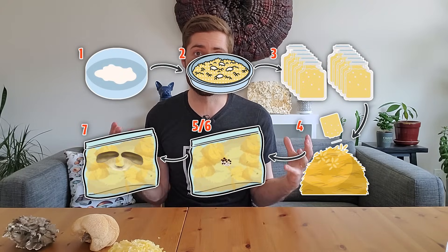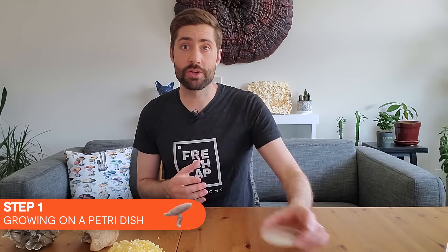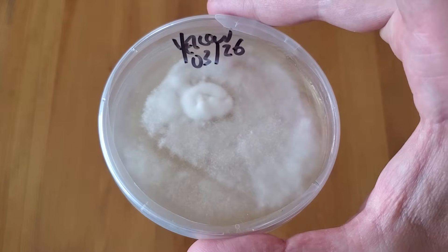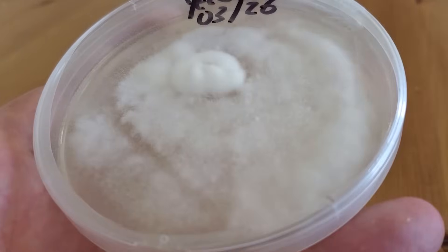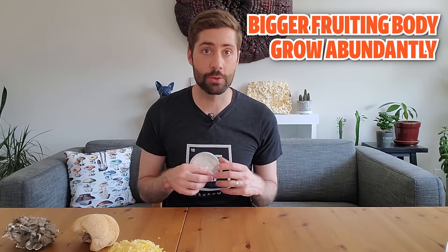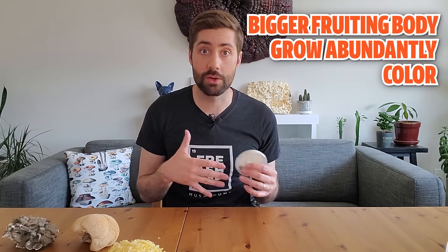I've broken this process down into seven basic steps that basically any cultivation technique follows to some extent. Step one is growing mushroom culture out on a petri dish. When I say culture, I'm specifically referring to the mycelium of a species of mushroom that has been chosen for its advantageous genetics. There are some commercially available strains that have certain characteristics — maybe they produce a bigger fruiting body, grow abundantly, or are selected for a certain color or size. Either way, when you buy a mushroom strain online you're typically buying a proven commercial strain or culture.